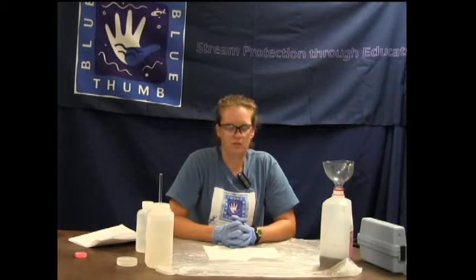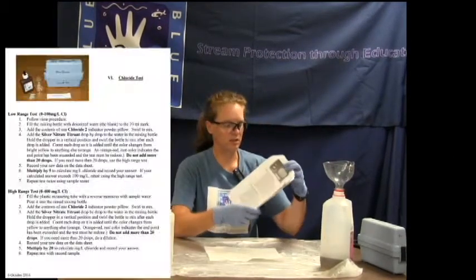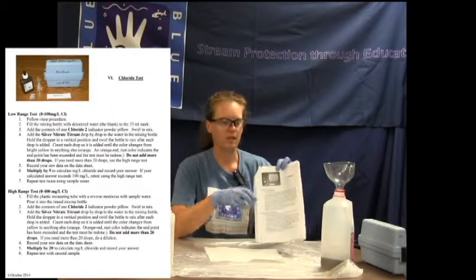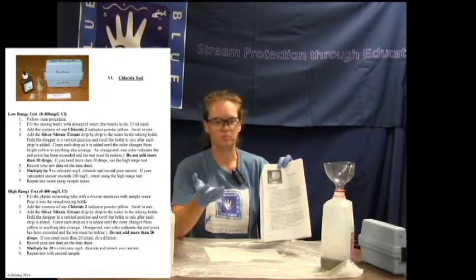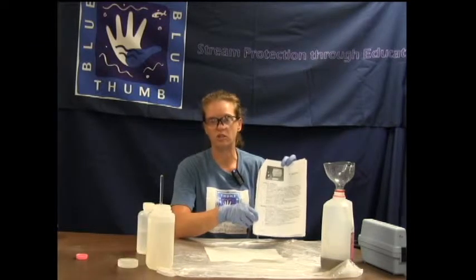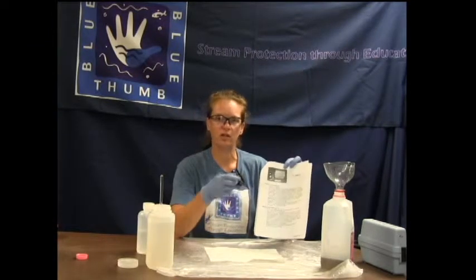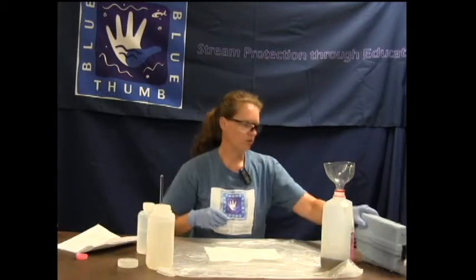This segment is about the chloride test. On the chloride test, if you read the instructions, you'll see that there is a low range test and a high range test. Always start with the low range test unless you have been testing your creek for several months at least and have determined that you always need to go to the high range test. Then it's fine to start with the high range test, but always start out with a low range test and we'll see how that goes.